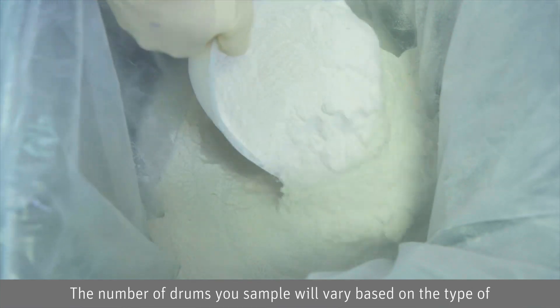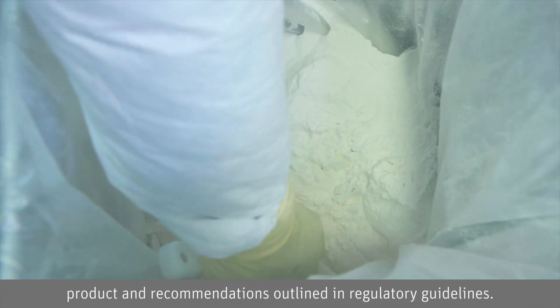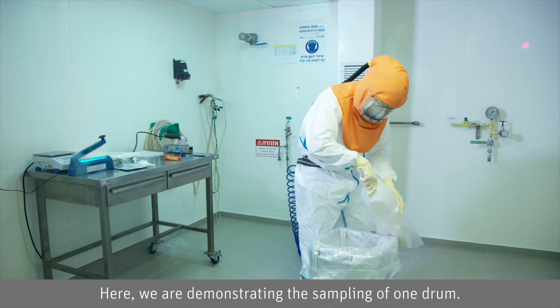The number of drums you sample will vary based on the type of product and recommendations outlined in regulatory guidelines. Here, we are demonstrating the sampling of one drum.